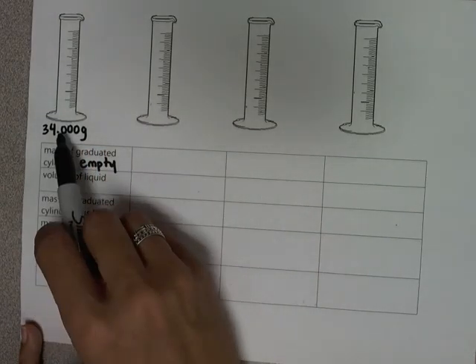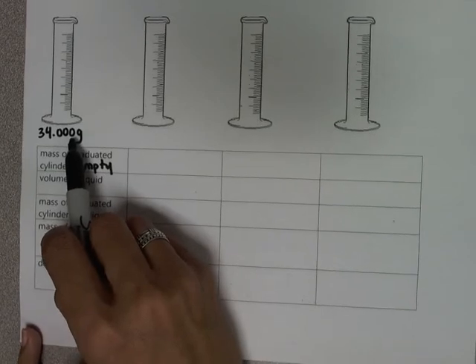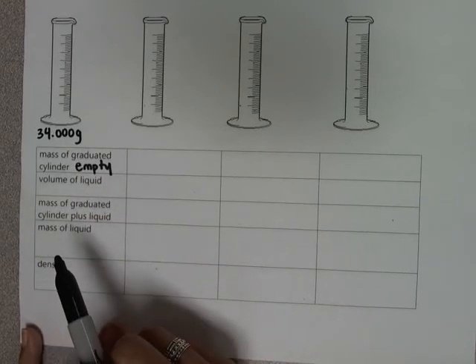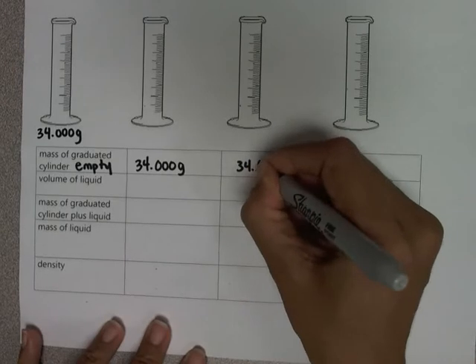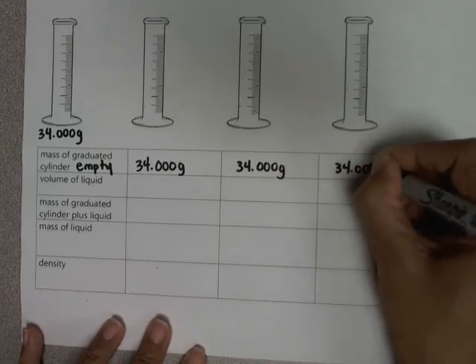And notice that I am listing 3 decimal places because the balance on Late Night Lab lists 3 decimal places. So I'm going to put all 3 decimal places even if they are zeros. And so the empty graduated cylinder will be 34 grams, and that is not going to change.